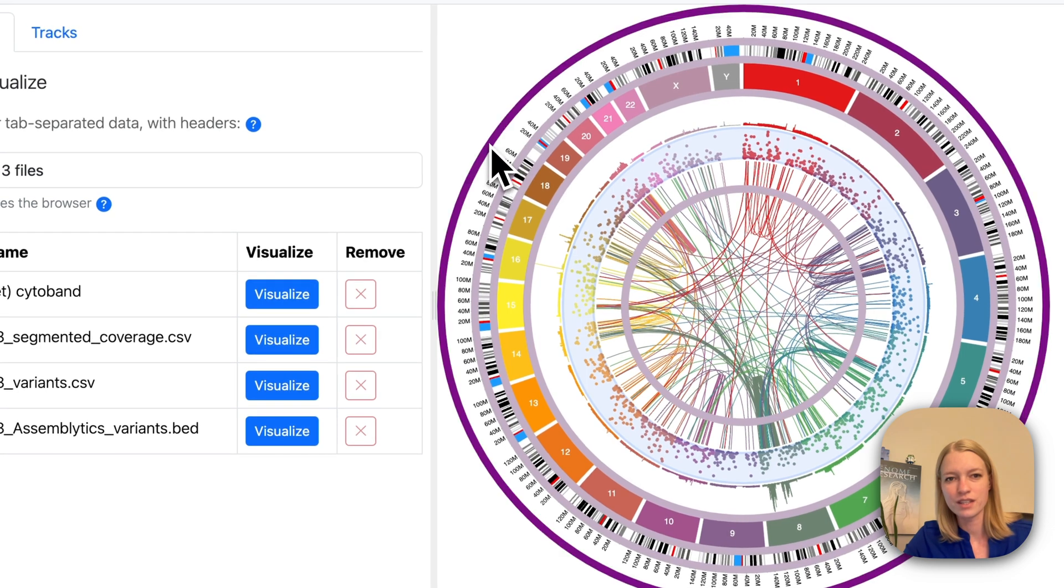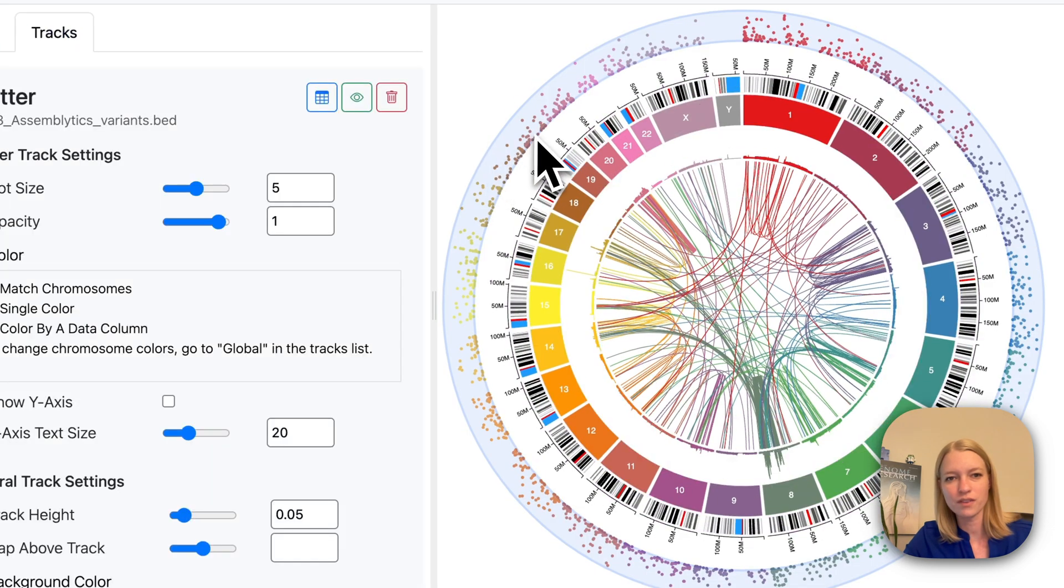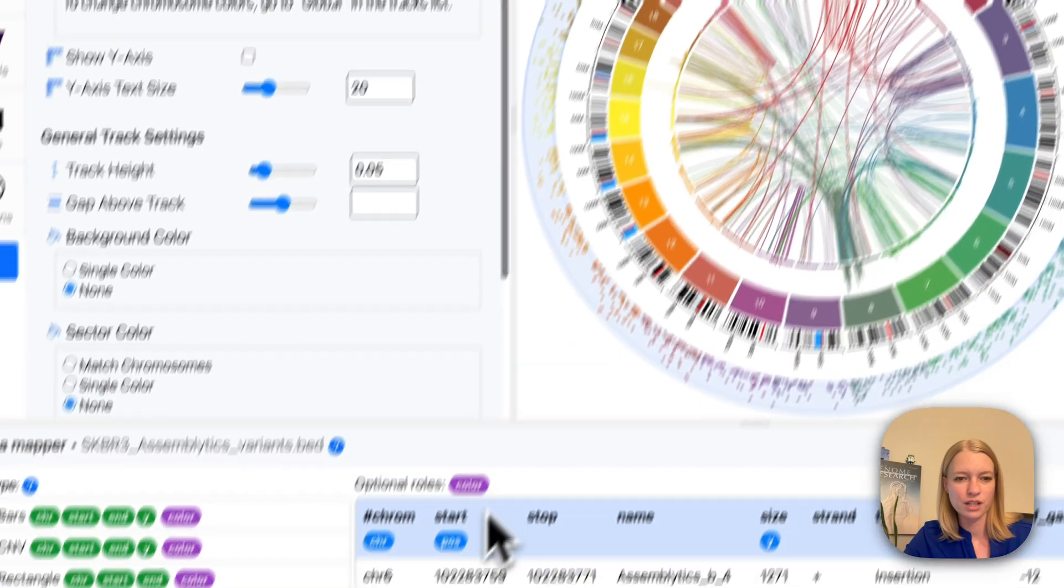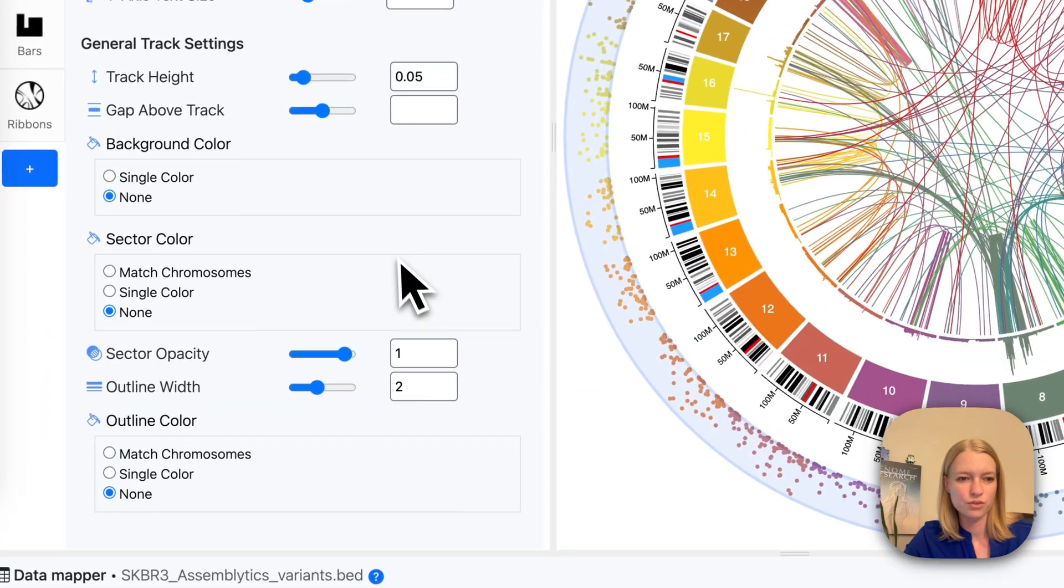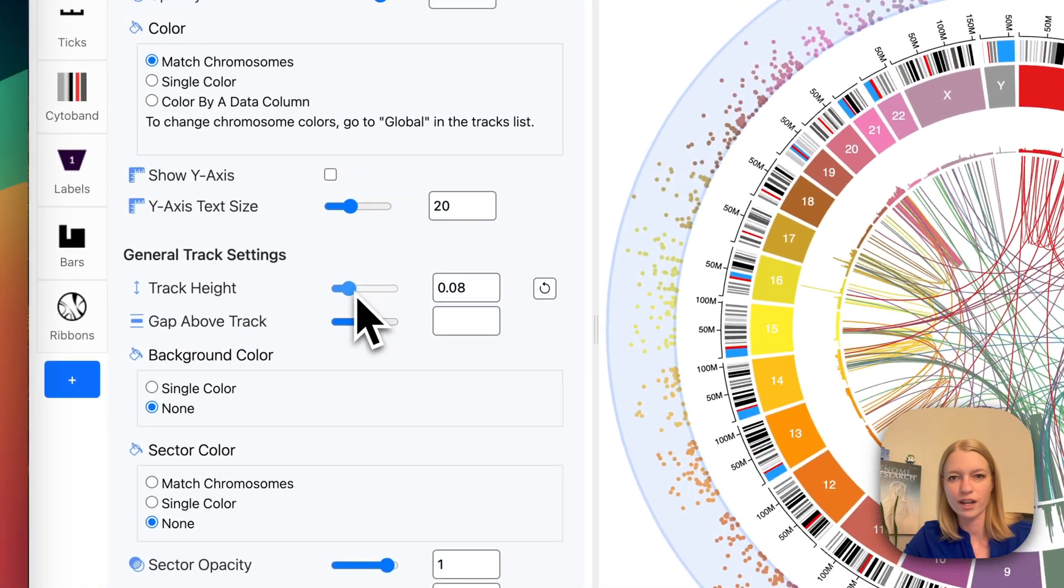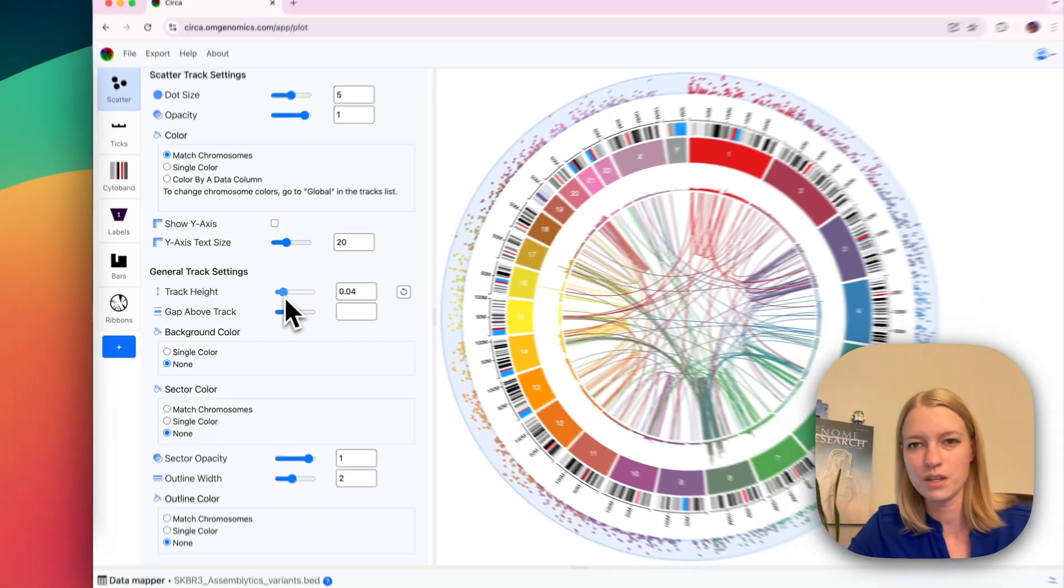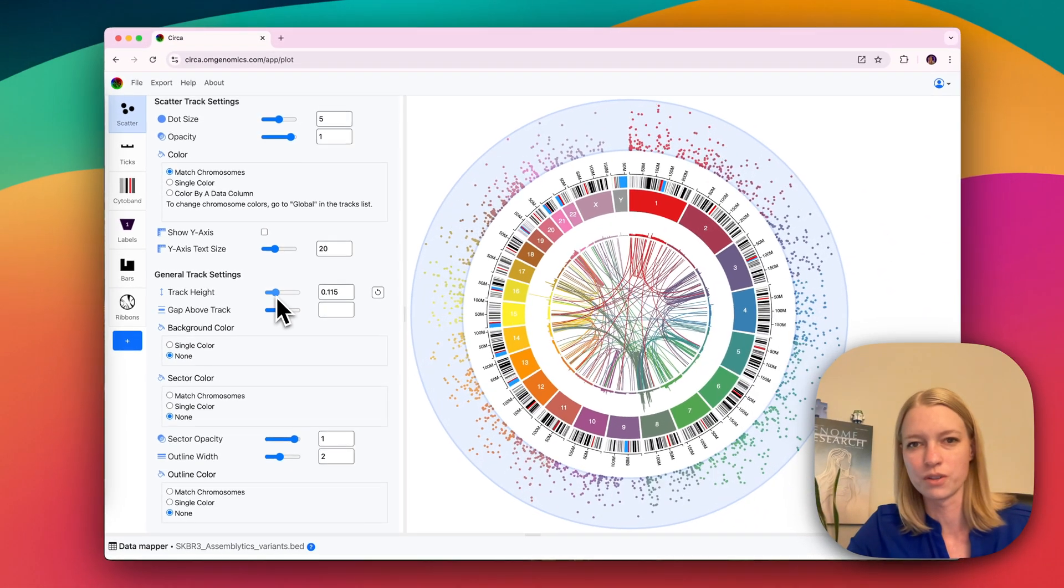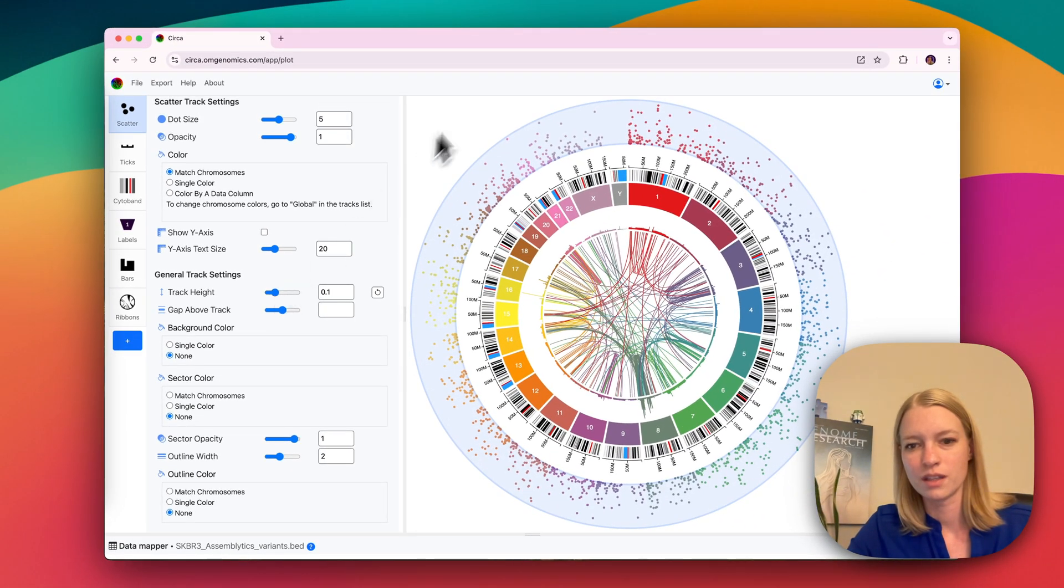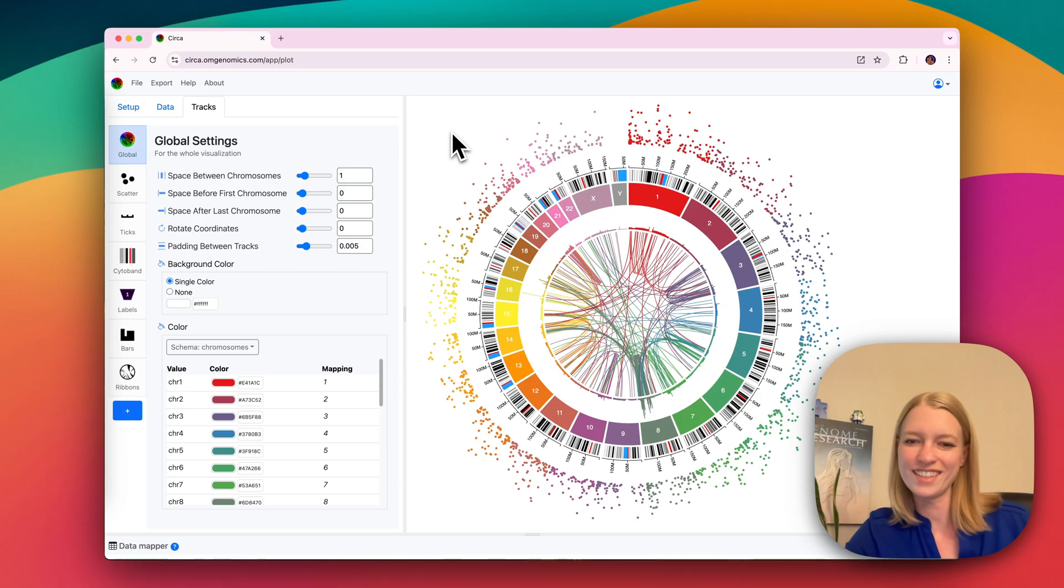And then we're going to drag this track out to the outside and we'll click on it to change the track height so we can make it as big or as small as we want it to be. And I think I want it to be like this. Done.